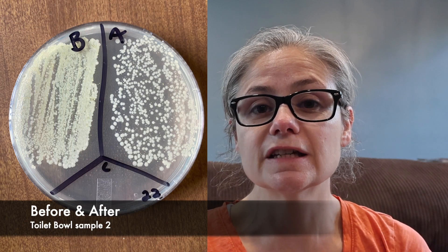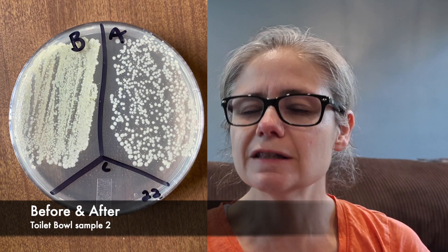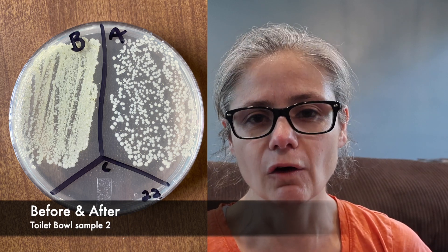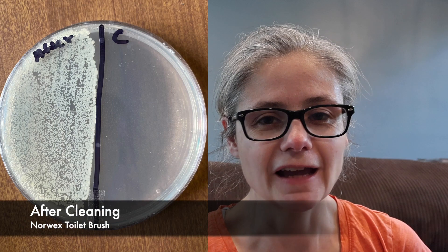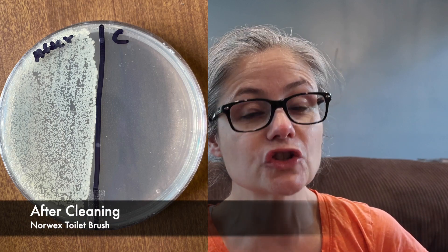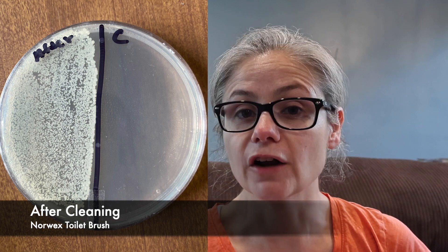Let's look at the second sample from my toilet bowl. Again, in the before section we can see a ton of bacteria, and in the after section we can see a visible decrease in bacteria, but it's not a significant amount at all. Looking at how much bacteria is on the toilet brush immediately after cleaning the toilet, we can see there is a lot of bacteria on that brush — so the brush most certainly did pick up a lot of bacteria.